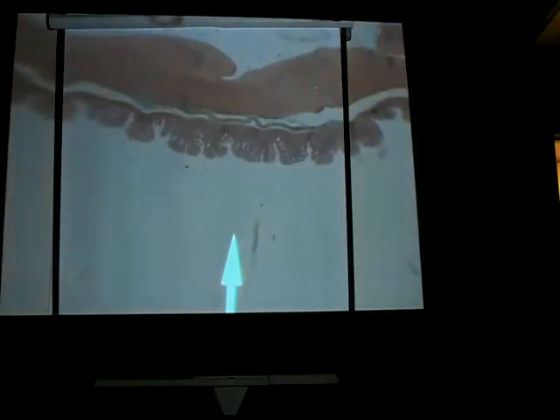This is at the junction of the pyloric stomach and the duodenum. Notice within the stomach, the epithelium is folded into what are called rugae, but because the stomach is so large, usually you're just seeing a small portion of it. So pretty much you have this flat appearance of the stomach. You don't have any part of it that's projecting outward more than the rest of it. The surface looks kind of flattened.